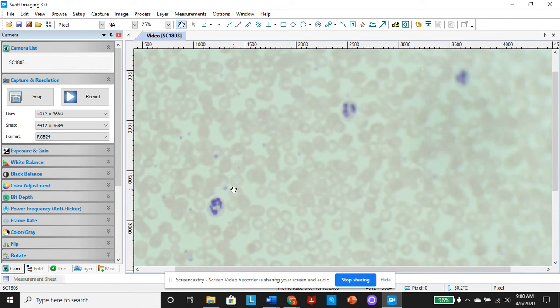Now you can start seeing all these little light purple dots. These light purple little tiny dots, smaller than the red blood cells, those are your platelets. Platelets play an active role in helping you stop bleeding. When you get a cut, there are these juices that are released from your tissues that go into your blood, and it sends out a chemical signal that allows these platelets to come together and aggregate. That just means they all stick together and they form what's called a fibrin clot. And that's what a scab is. It's just a ton of these little purple platelets.